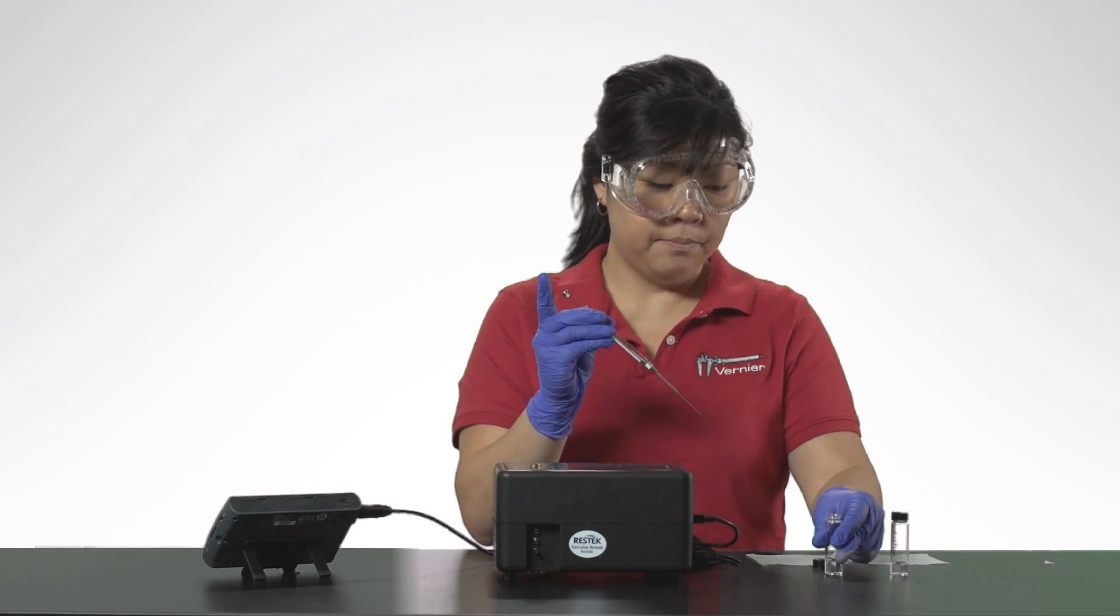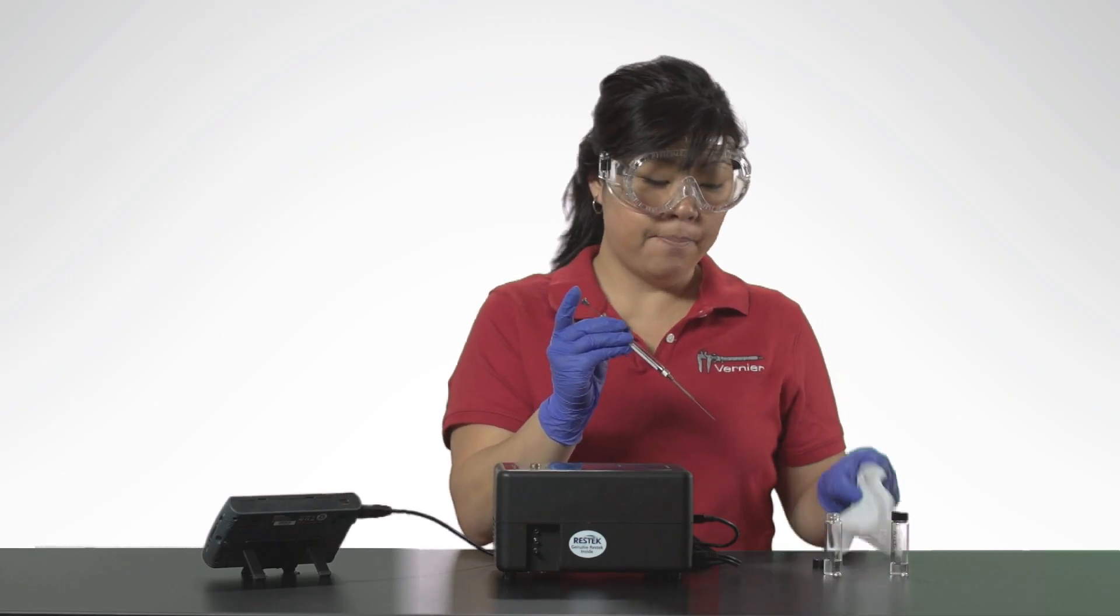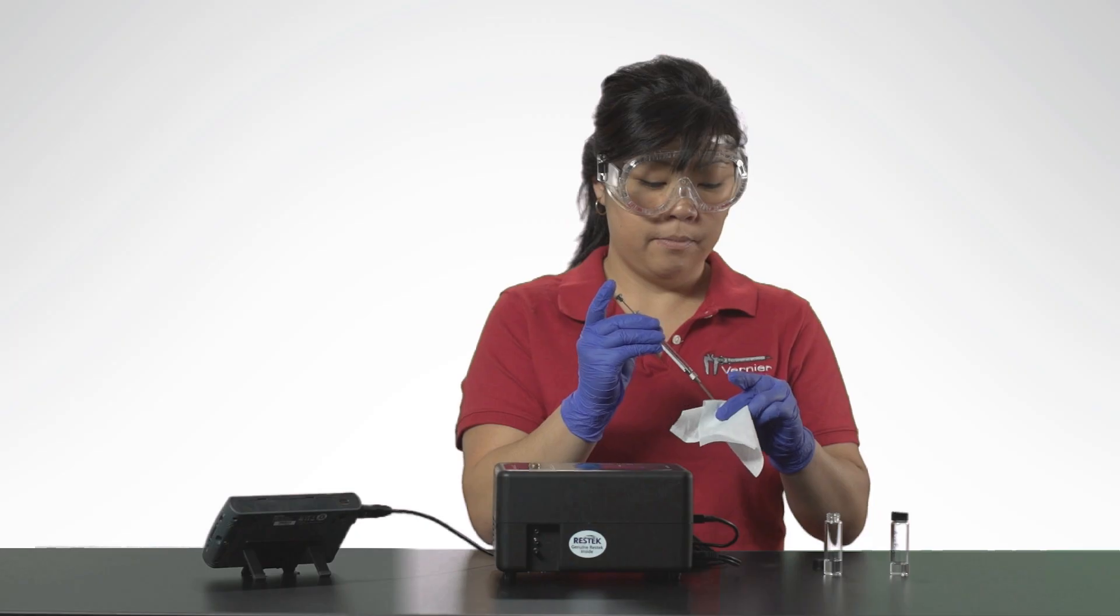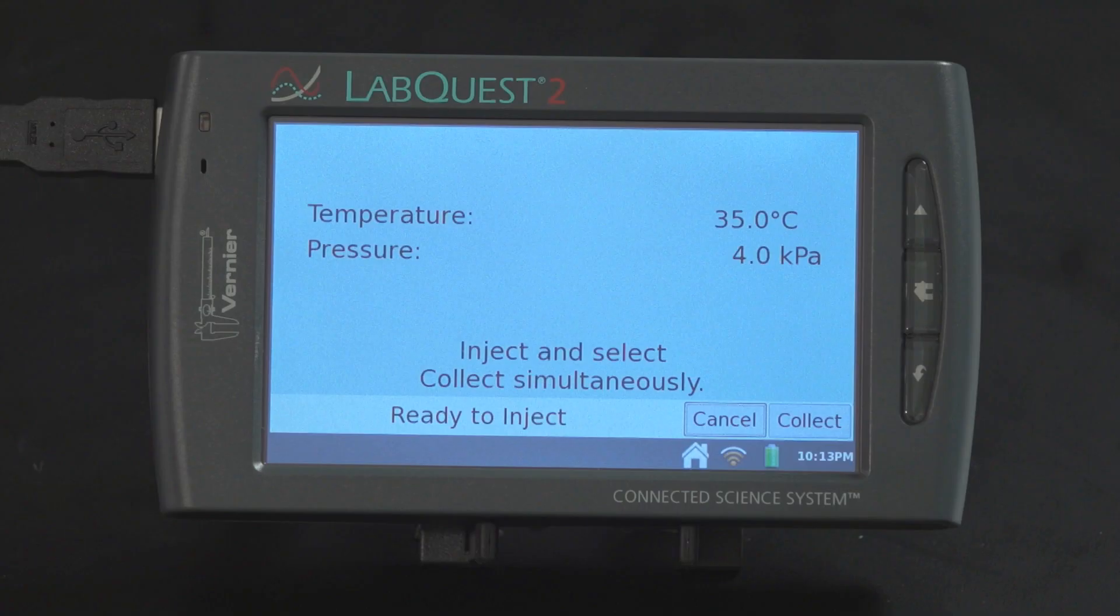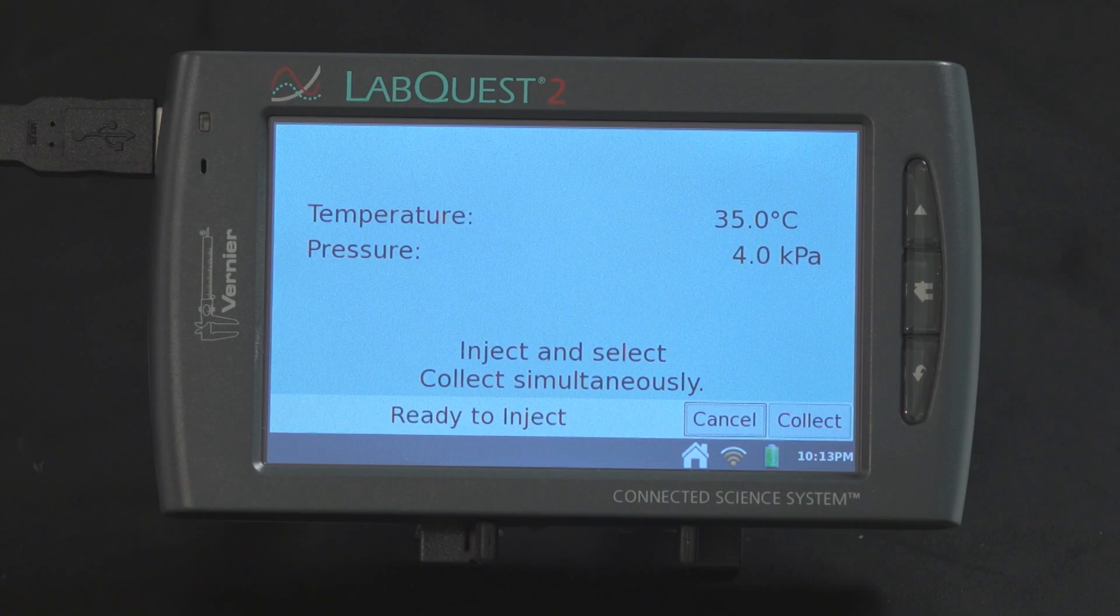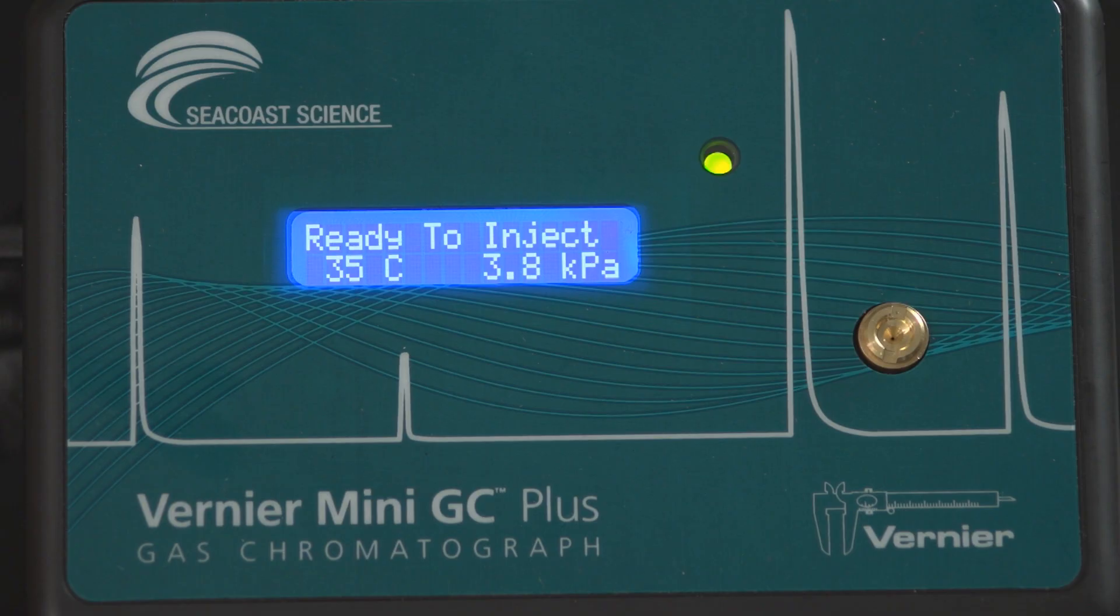After collecting your sample, gently wipe the needle from barrel to tip. When the Mini-GC Plus has reached the correct start temperature and pressure, the message reads inject and select collect simultaneously and the LED on the Mini-GC Plus is green.